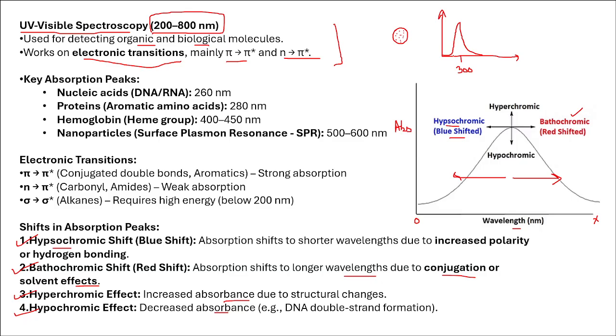There could be some kind of shifts or spectral broadening, or you can see the spectra somewhere like this. It could be like this, or it could be like this as well. Some spectral broadening or a minute shift, not a lot of it, but a minute shift, like 5-10 nanometers. So, based on these differences in the absorption spectra, we interpret the difference between our free drug and the nanoparticle.